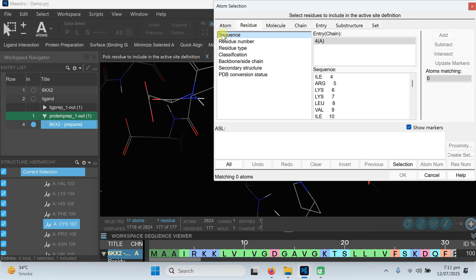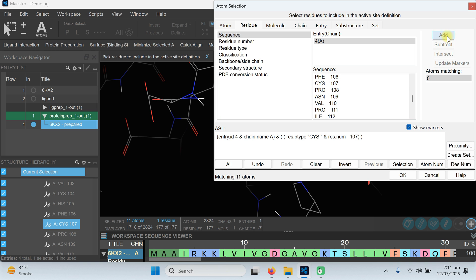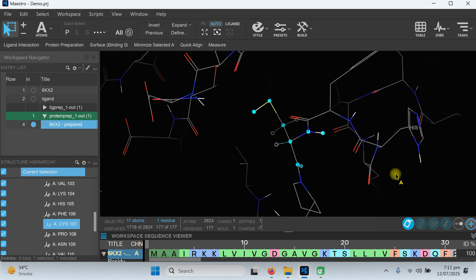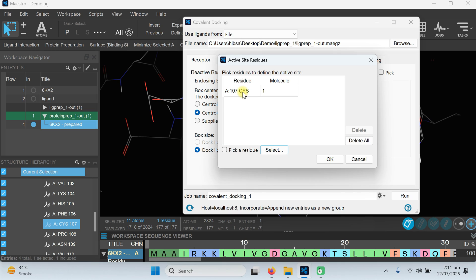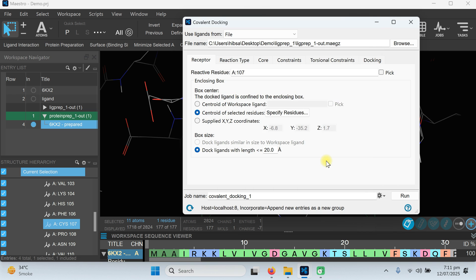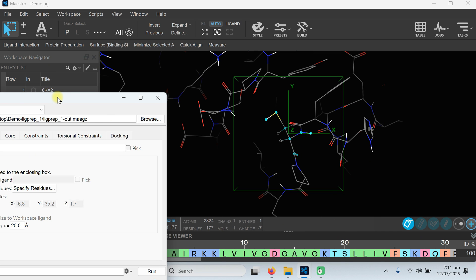Click on 'Sequence' and from the sequence view locate residue 107. Click Add and click OK. A new window will appear — select 107 and press OK. Our molecule has been selected and you can see a grid box has been generated around it.